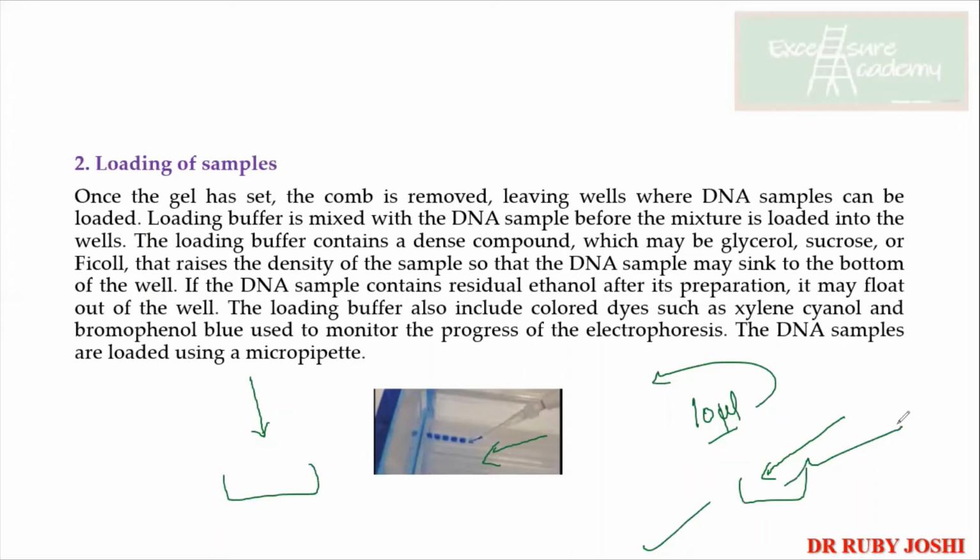So it is all based on your practice. Either load it vertically so that the deviation because of the refractive index is not coming, or with the practice you can also do.